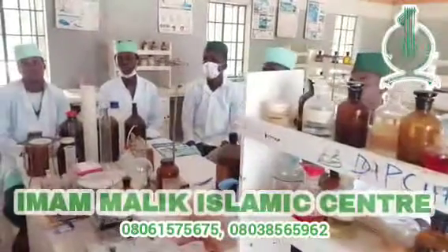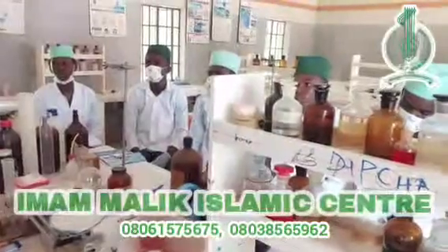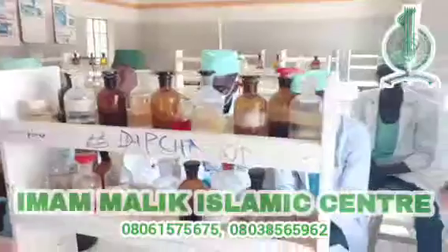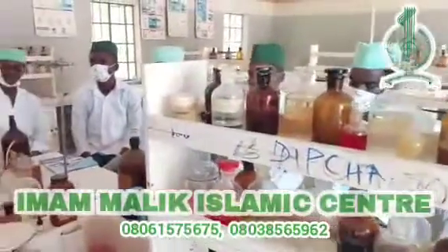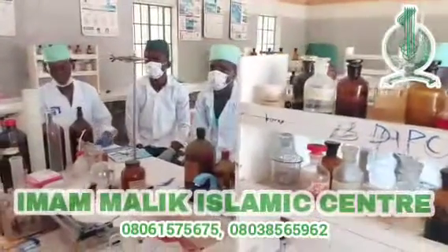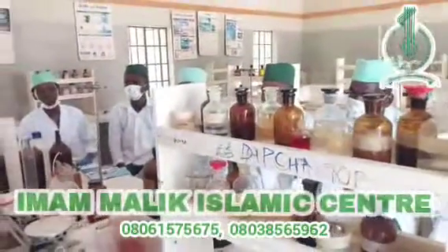Then why are we buying this? Can't we just come to the lab, measure it at random and do the experiment? It's not possible. You have to get graduated vessels, because it's from there you'll be able to know, okay, this is the exact amount I used and this is what I produced.